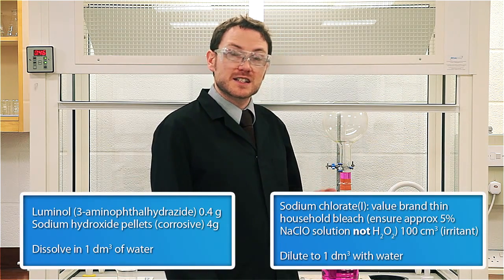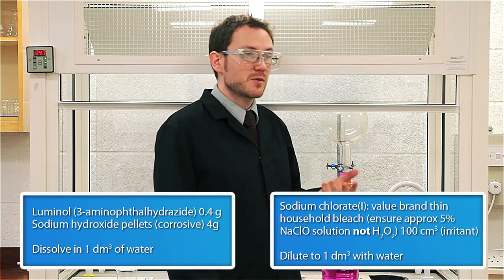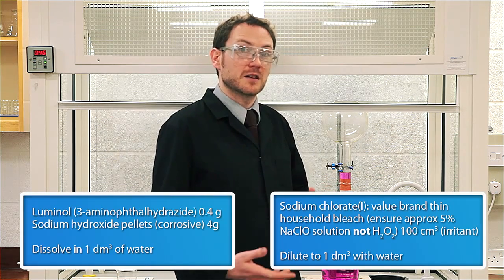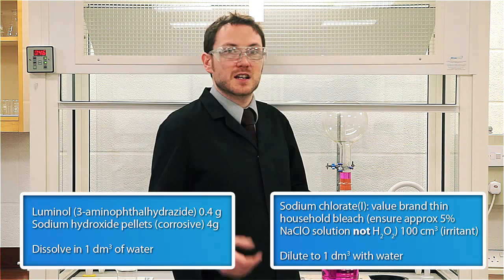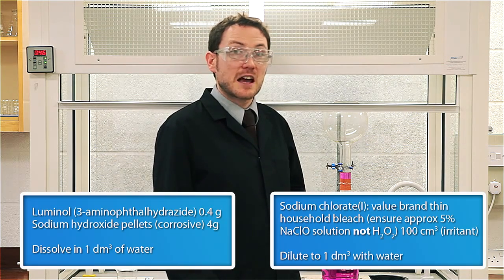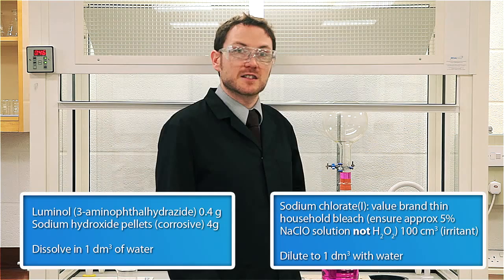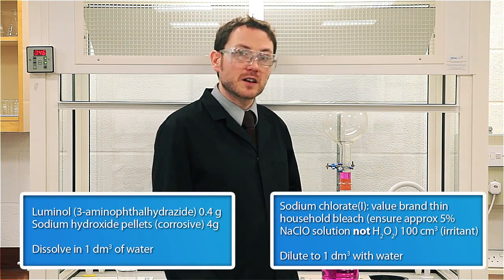We're going to get one flask containing a luminol solution — that's 0.4 grams of luminol and 4 grams of sodium hydroxide pellets made up to a litre. The other one is going to contain an oxidant. Household bleach works quite well: 100 ml of that dissolved up to a litre. Make sure it's the kind that contains sodium hypochlorite, not hydrogen peroxide. We need to do this in the dark, so let's head downstairs.